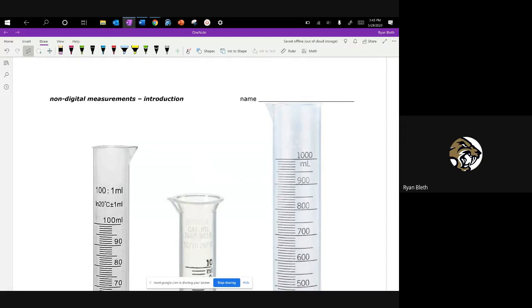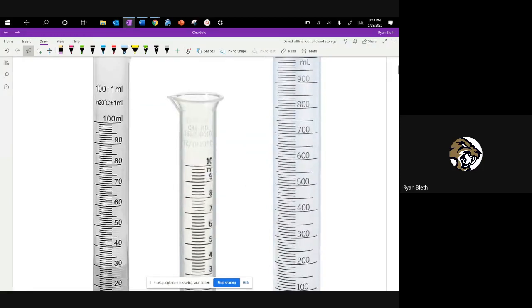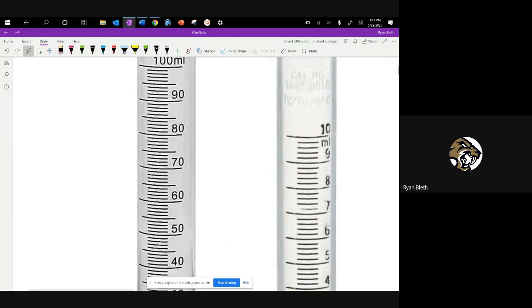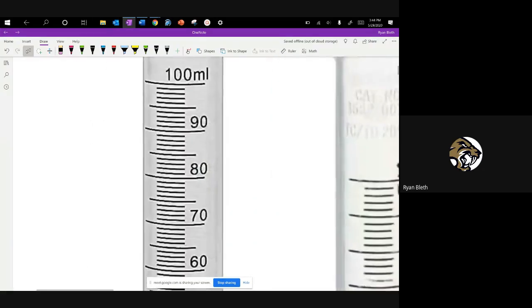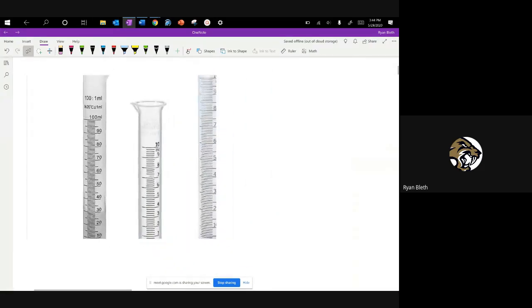I'd like to tell you a little bit about how to make non-digital measurements. You heard a little bit in the last video about how non-digital measurements include things like using a flat surface and looking at them at eye level and reading the lowest point of the meniscus. But the part that's trickiest for most students is looking at a device like a graduated cylinder.